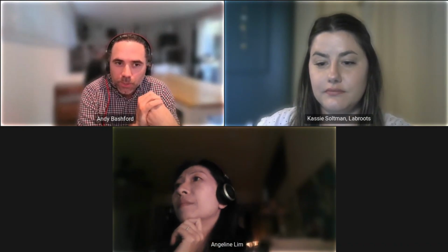Our first question says, what is the scale of bioreactor used to grow organoids? I'm happy to take this, Angeline. In terms of scale, physically, you can think of it as maybe the size of your hand. In terms of how many organoids it can work with, it depends a little bit on the organoid in question.